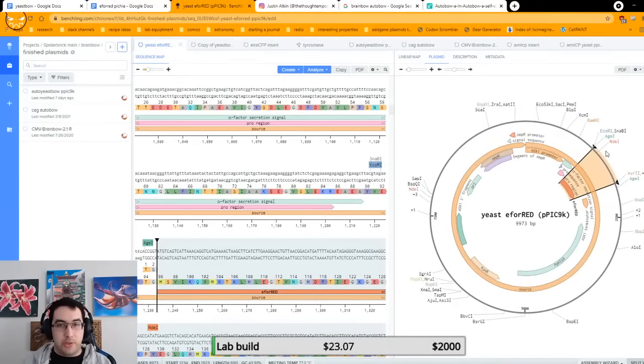So that's these ones. There are a few more, and I actually have my list, so give me a second to pull it up, that I wanted to talk about. The egg and the milk plasmids. These were one of the first ones that I designed on stream, and here I'll pull them up so I can show you.